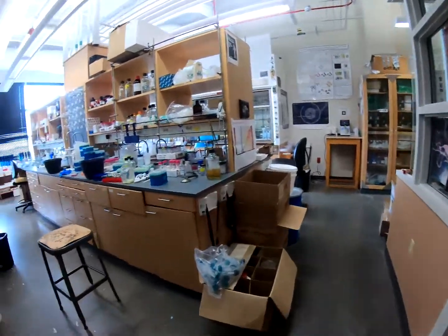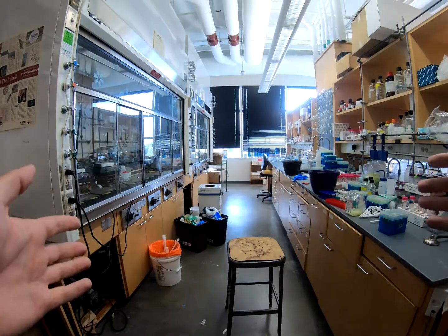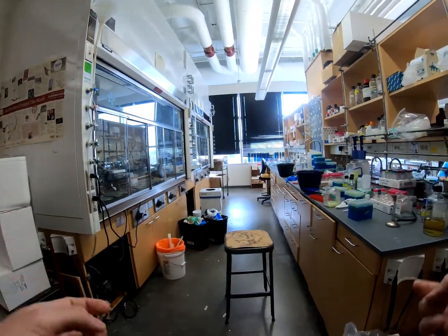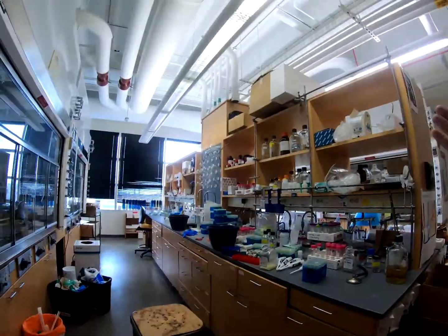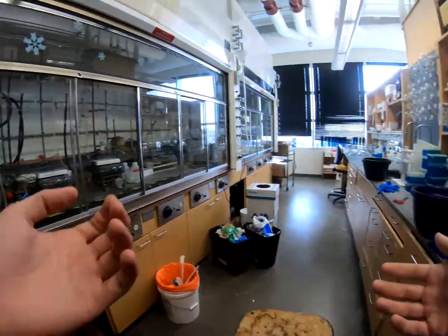Coming down into the middle of the lab, we've got the lane where we have two of our benches and the overall lab stations. So similar to in Lab A, we've got our bench top, cabinet space underneath, shelf space above, and then a whole hood per person working at the station.